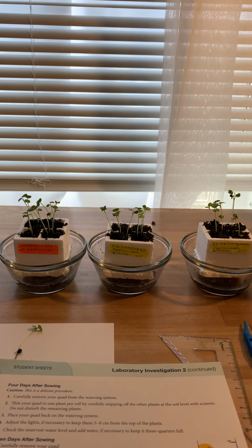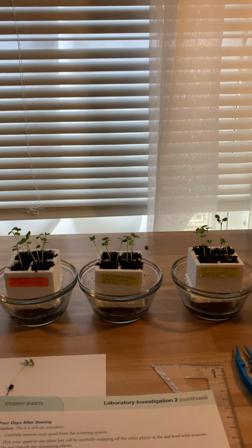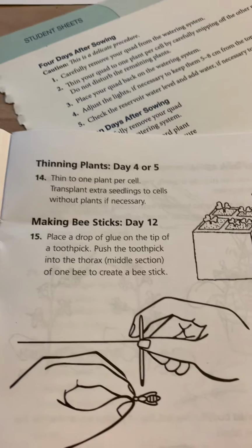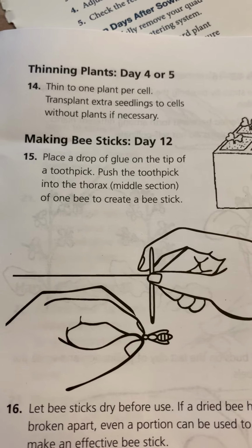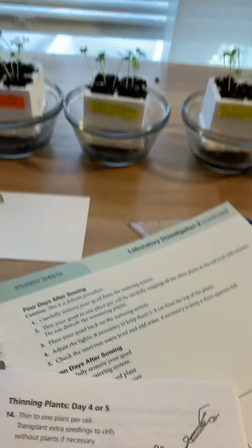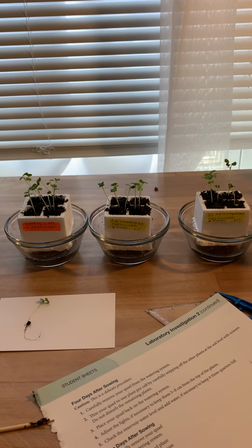This is a little bit tricky. This was direction number 14 in the paper instructions that I gave you. So today, I'm going to show you how to do number 14, thinning the plants, day 4 or 5. I'm going to be doing a method like this, very carefully plucking out all of the plants in each of the wells except for a singular plant in each hole.